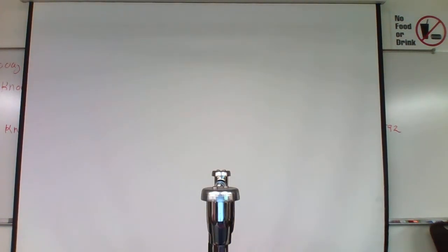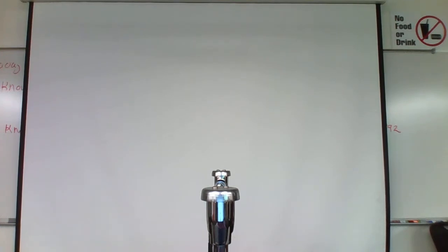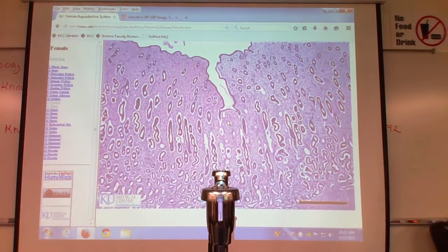Okay, girl slides. Now the fun begins. Let's do girls. So we have to know what's first. Oh, yes. Uterus. This is a uterus. Okay. Name this organ. That's a uterus.